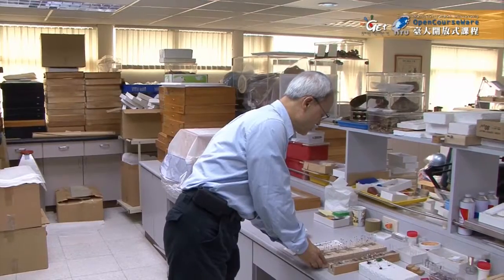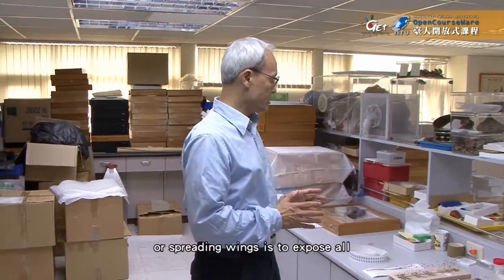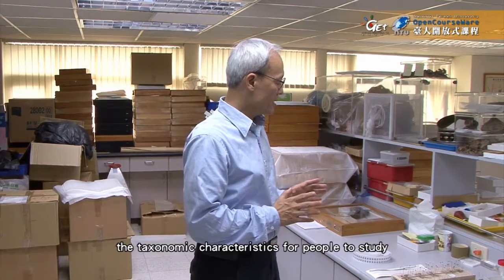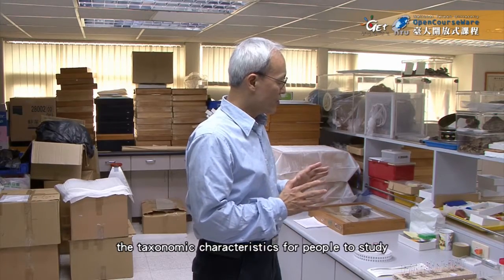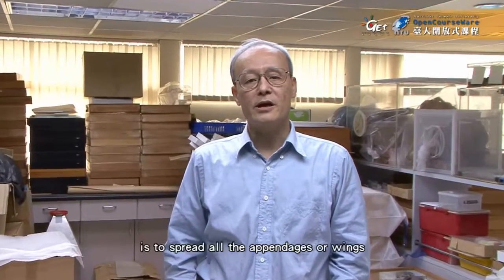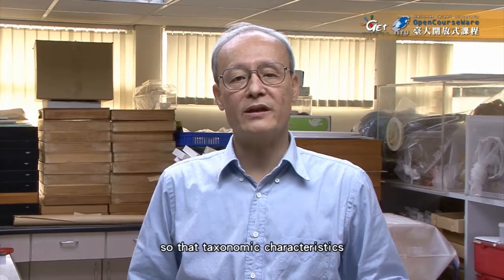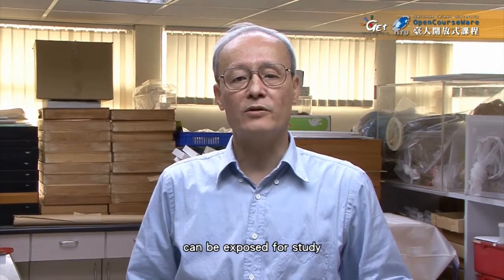Again, the main purpose of either spreading legs or spreading wings is to expose all the taxonomic characteristics for people to study. The main purpose of leg spreading or wing spreading is to spread all the appendages or the wings so that taxonomic characteristics can be exposed for study.